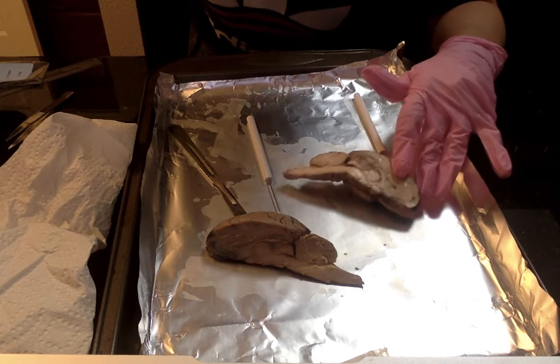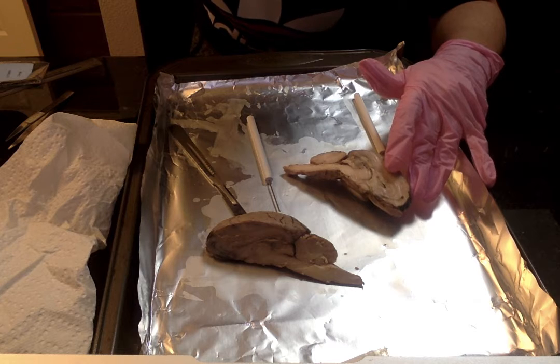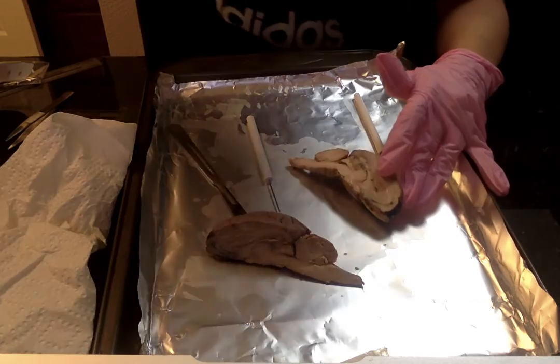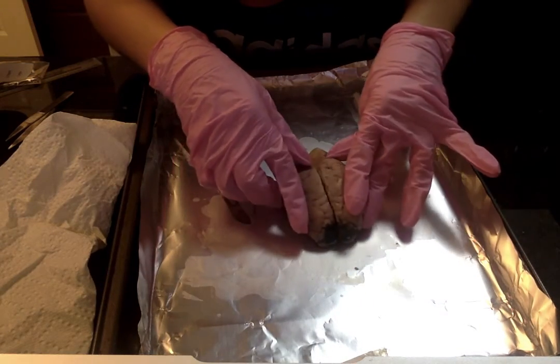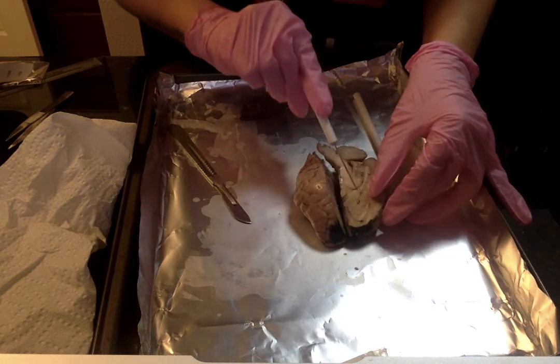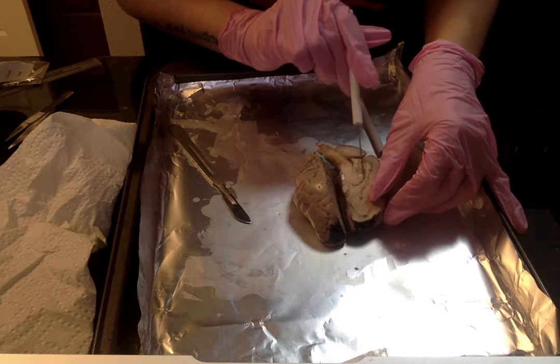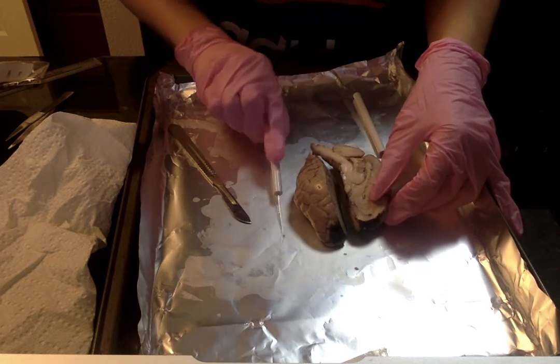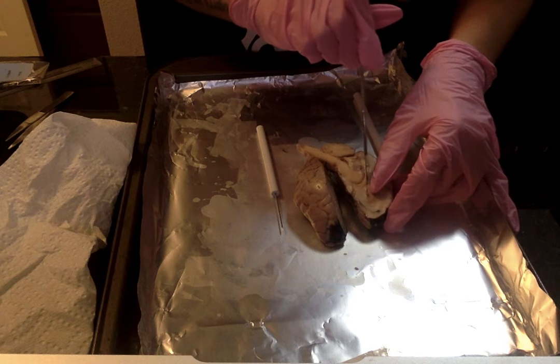I wanted to take some time to look for the corpus callosum, and that's basically what connects the two hemispheres here. I want to say that right in this area here, I don't know if I can separate it a little bit.